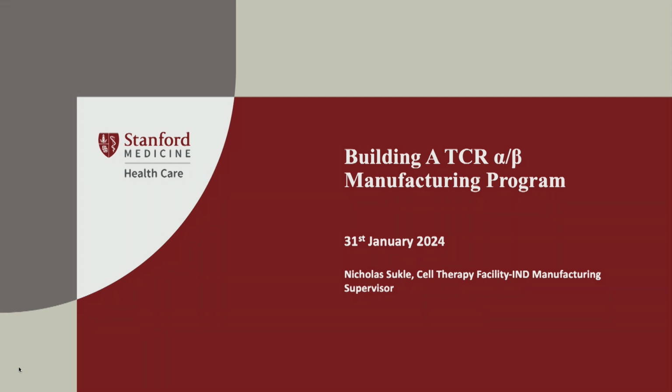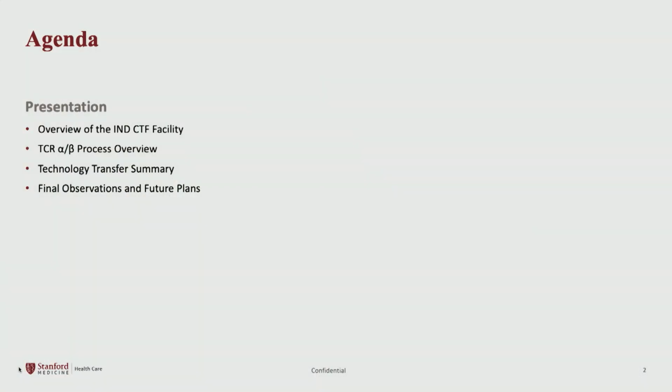Hi everybody, my name is Nick Sukle, and like Gavin was saying, I'm the IND manufacturing supervisor at the cell therapy facility. And I'm going to be talking about building a TCR alpha beta manufacturing program. In this presentation, I'm going to go into an overview of our facility, since we are a little bit different than LCGM, and we're going to go over the entire TCR alpha beta process.